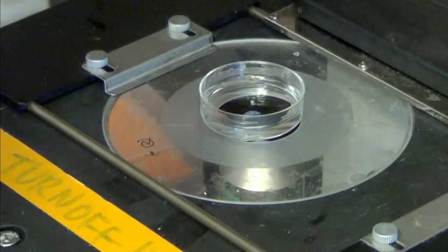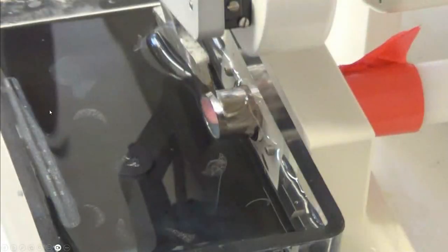So we will take the mouse slices. What I use is a sterile plastic bacterial loop to fish these slices out of this Hanks balanced salt solution water bath and transfer them to a petri dish.